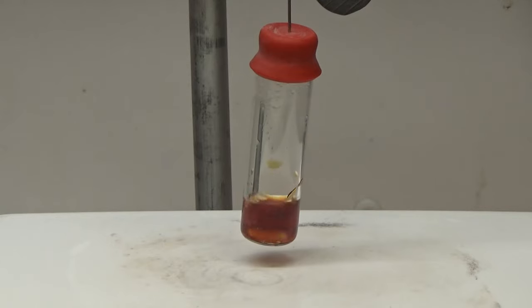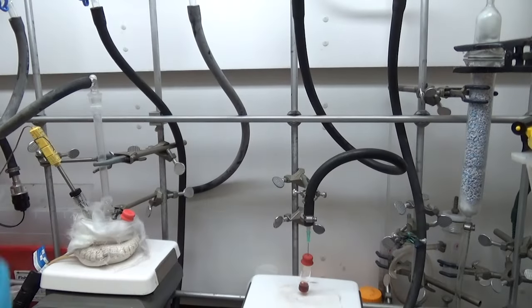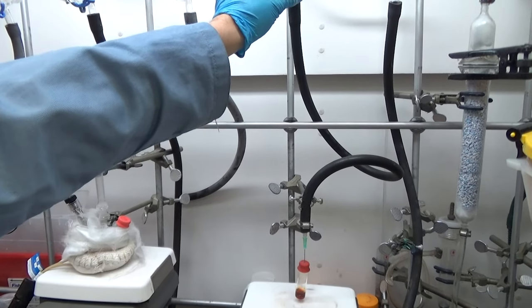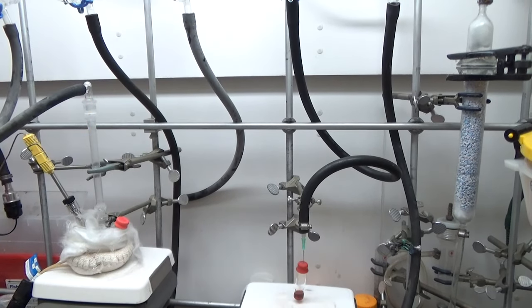As we heat it up and stir, the sulfur dissolves and you can see it get darker and darker. And as we pull vacuum, you can just tell visually when it's done degassing.